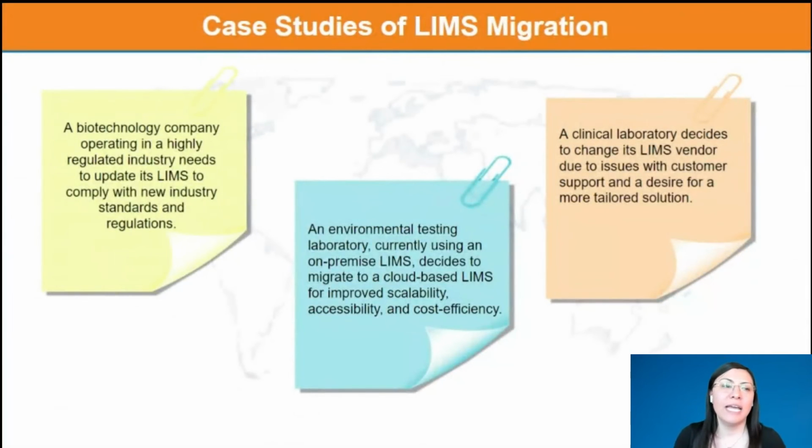Here we have some case studies of LIMS data migration that we have seen. The first one is a biotech company. They operate in a highly regulated industry, and they need a LIMS that supports this highly regulated environment. So they have to have different modules that allow them to keep the standards and meet compliance in their industry.